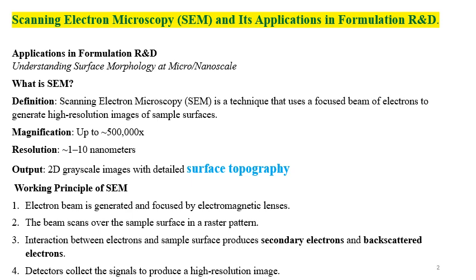I welcome all the viewers to this short video on SEM technique and its application. SEM means scanning electron microscopy, and it has many applications in understanding the surface morphology at nanoscale or microscale.